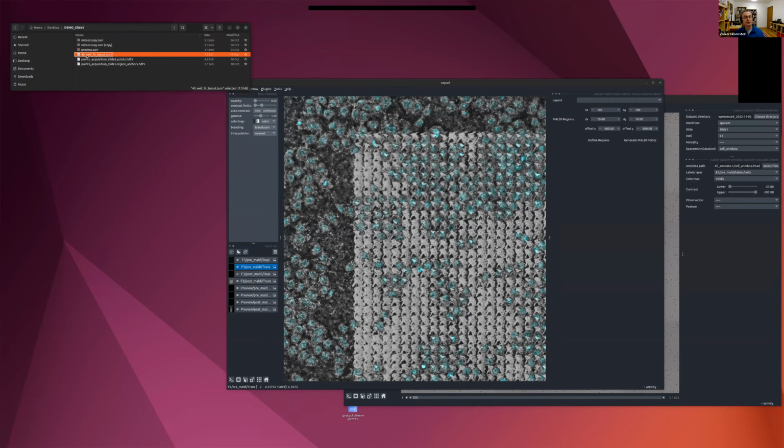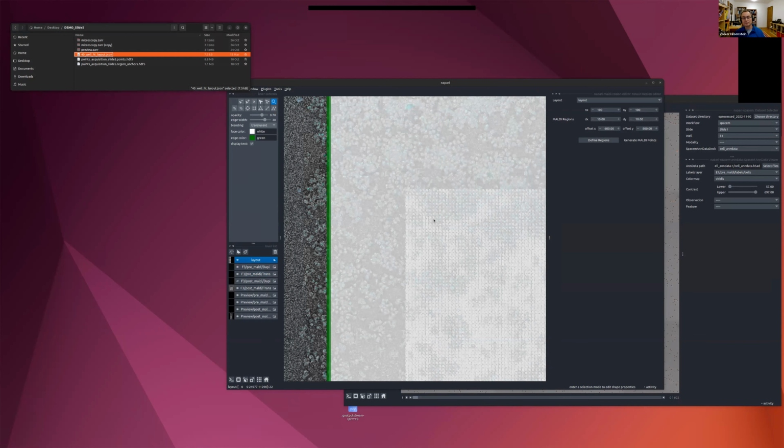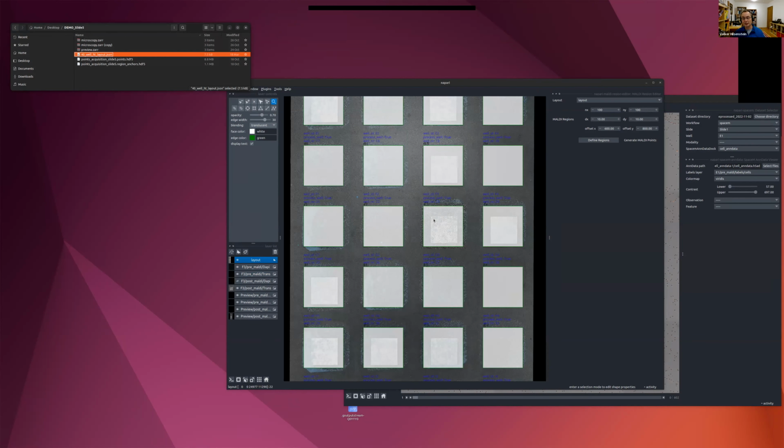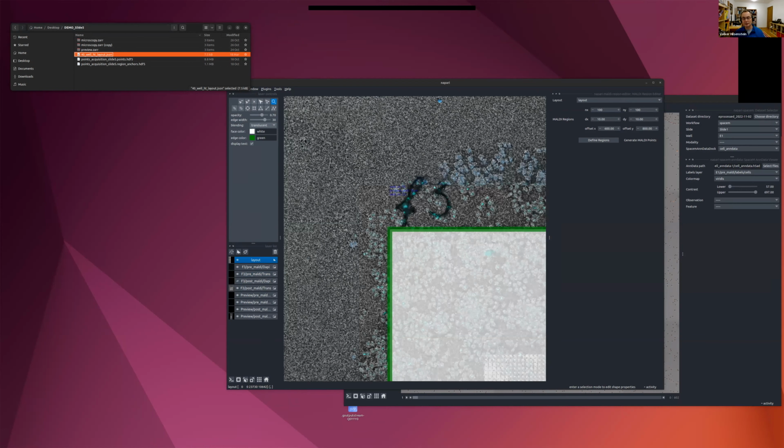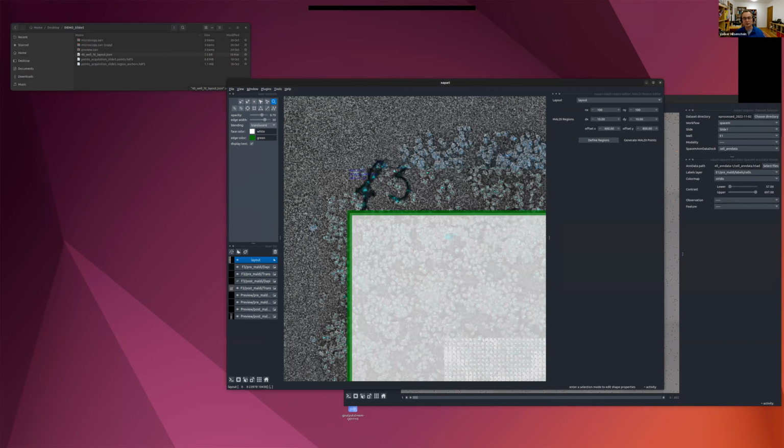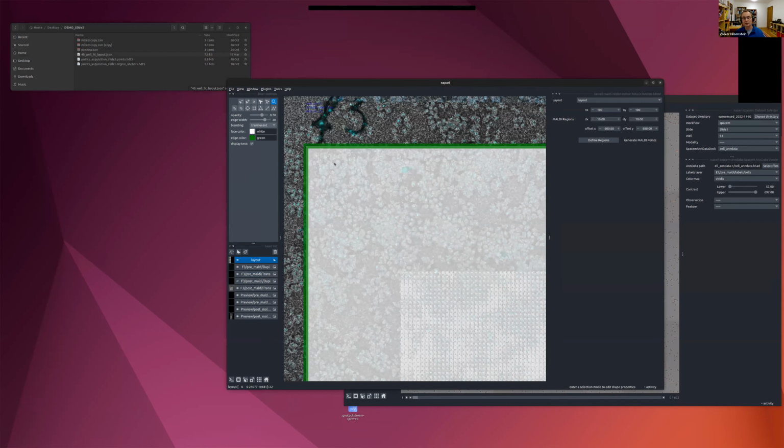And I'll show you this layout. You can just drag and drop it into Napari. You've got your layout layer here. You can attach properties. So in the end, well, in the future, we will want to have metadata for each well, like the treatments. Let's reduce the opacity.